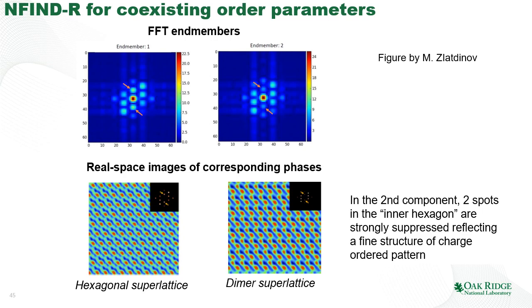We just managed to separate our image, where the physics of different phenomena is mixed, into the individual components without knowing a priori what these components were. And this is really truly exciting.